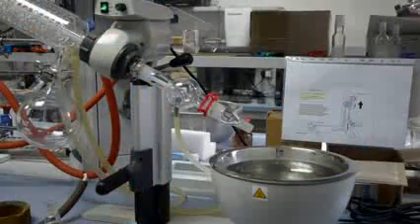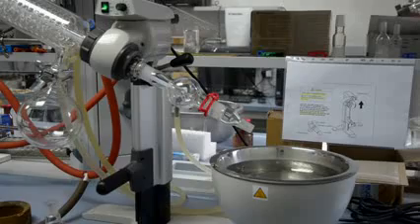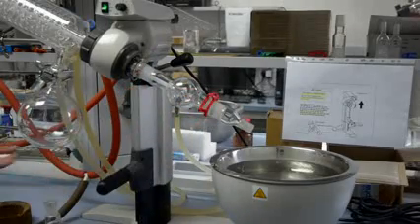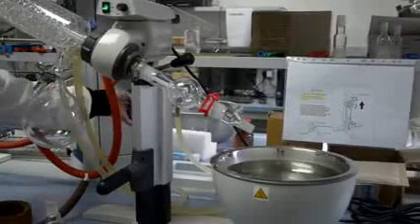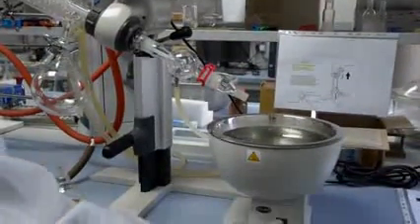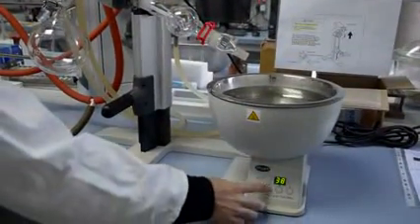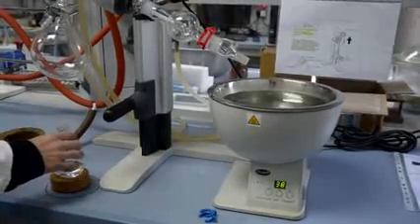Ensure the splash guard and adapters are clean before being used. Use a clamp to secure these into place and dispose of any waste present in the waste jar appropriately. Open the water flow and switch on the water bath, setting it to a temperature of around 15 degrees Celsius below the boiling point of the solvent in the reaction flask.